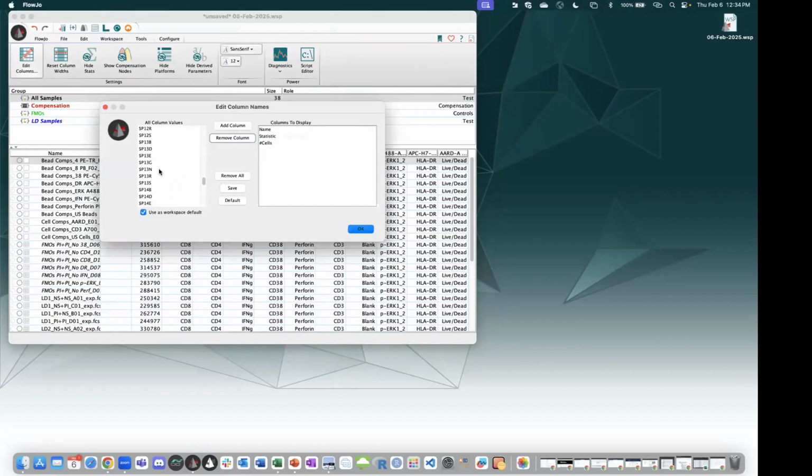And if you look at those keywords, one is condition, one is d-date, which in this case was the same as the patient ID, my stimulation, and my t-date. T-date was the date I ran the sample on the instrument. So really the two keywords that are needed for this analysis are my stimulation and my patient ID.